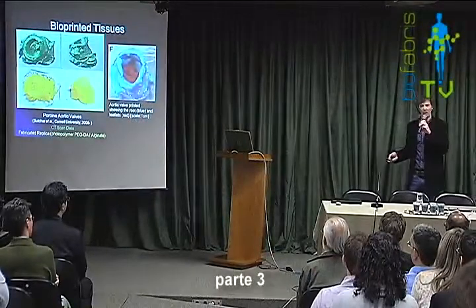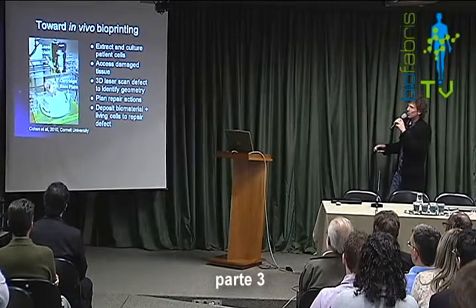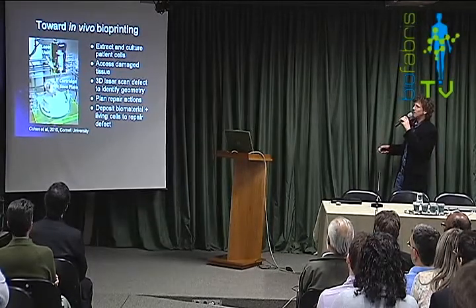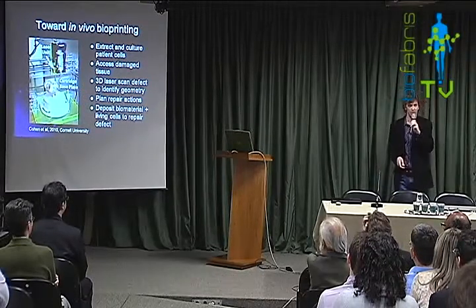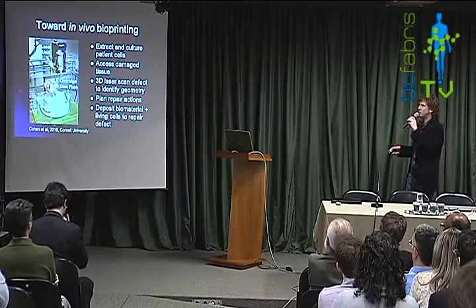Physiologically plausible geometry. And lastly, a colleague of mine adapted the fab at home with a 3D laser scanner, which is pictured right here, adjacent to the syringe dispenser. And the concept here was to explore the very early stages of in vivo printing. In this case, it's definitely not in vivo. This is an actual, I think it's a cow bone.